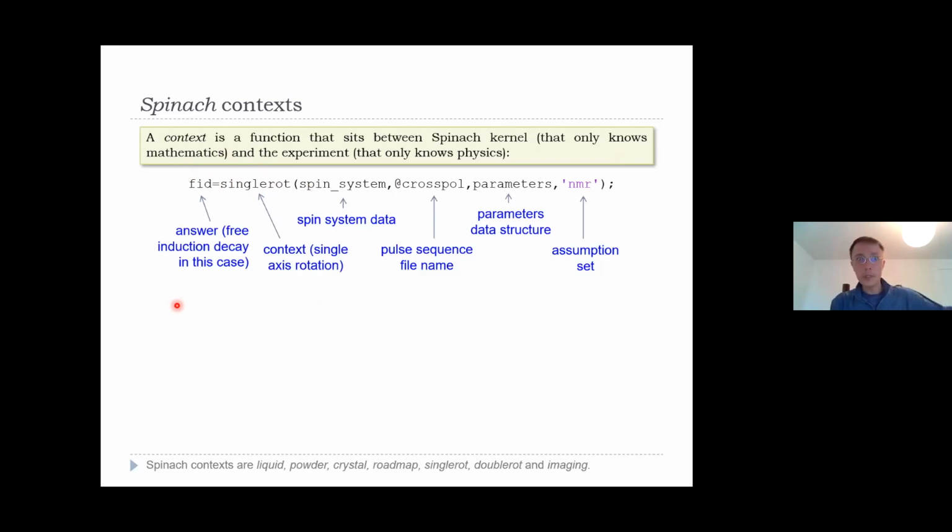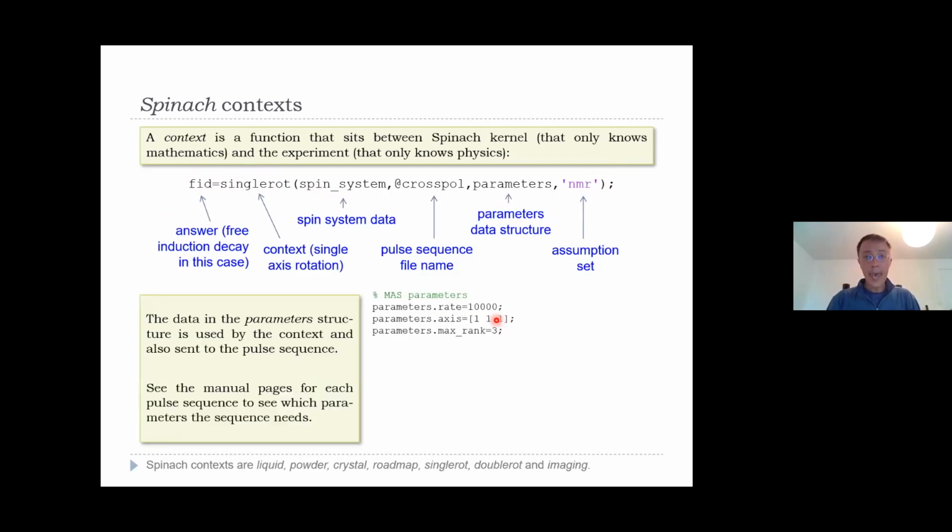You can Fourier transform it and get the spectrum. You can apodize it. You can export and process it elsewhere and so on. So this is packaged up into the sort of call that an inexperienced or a disinterested user can simply call.